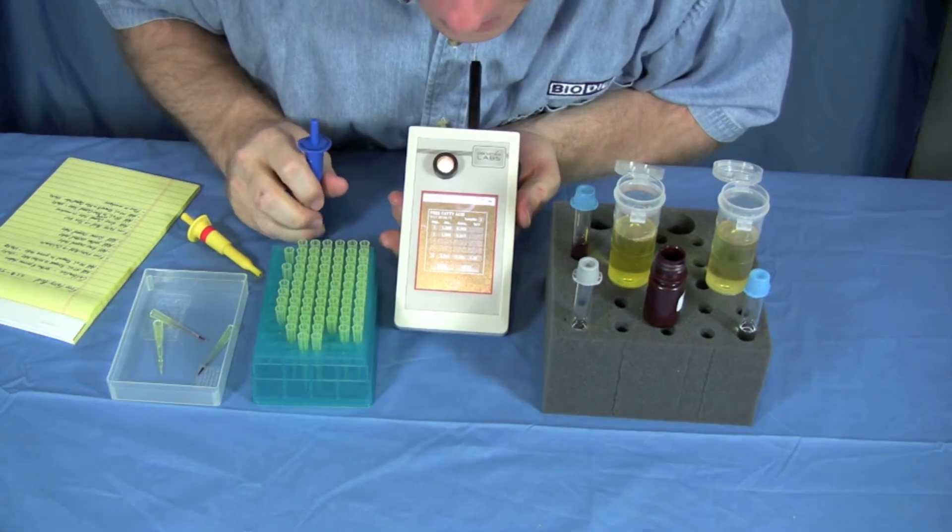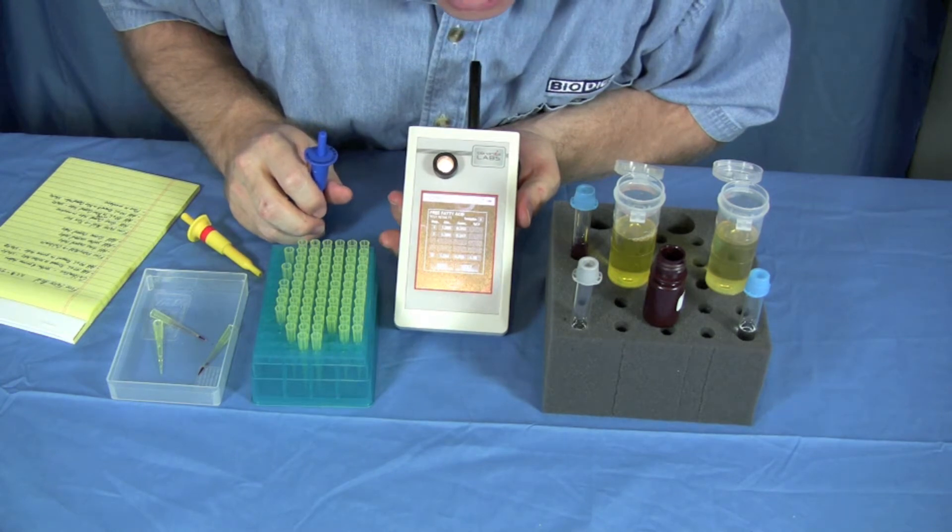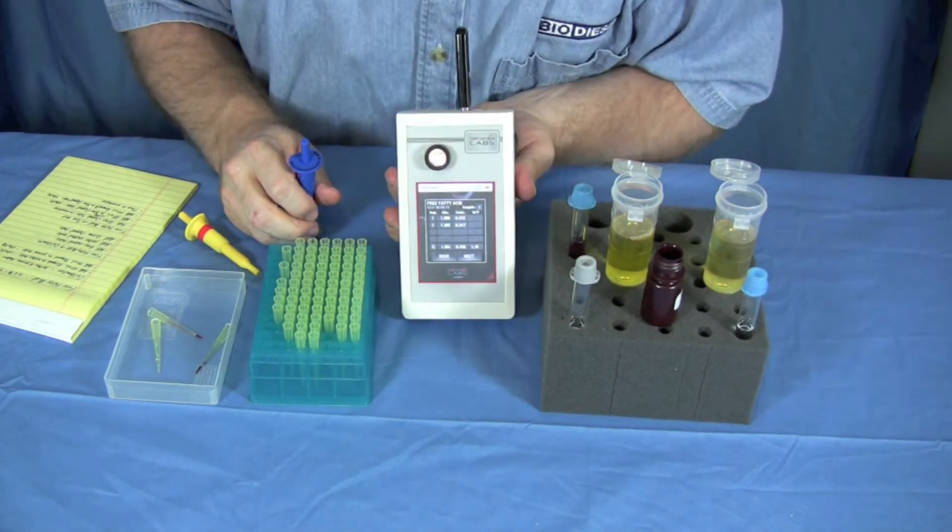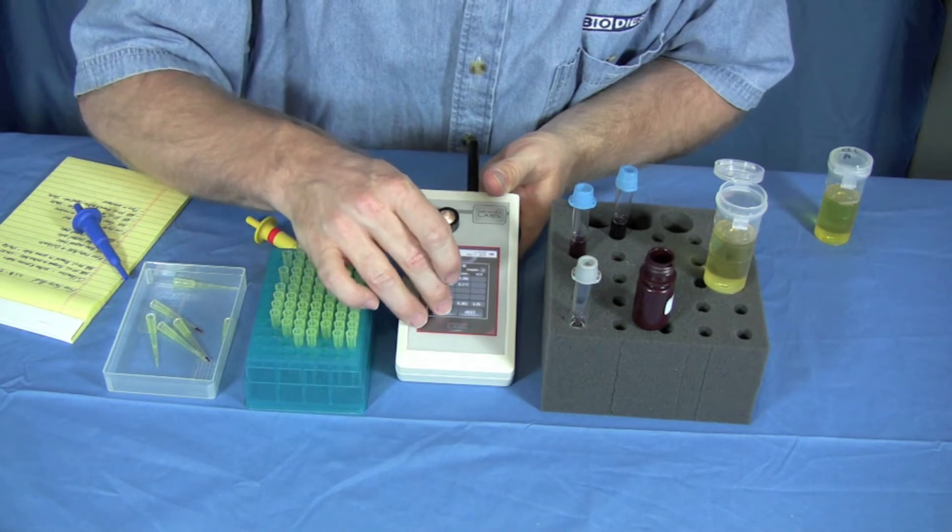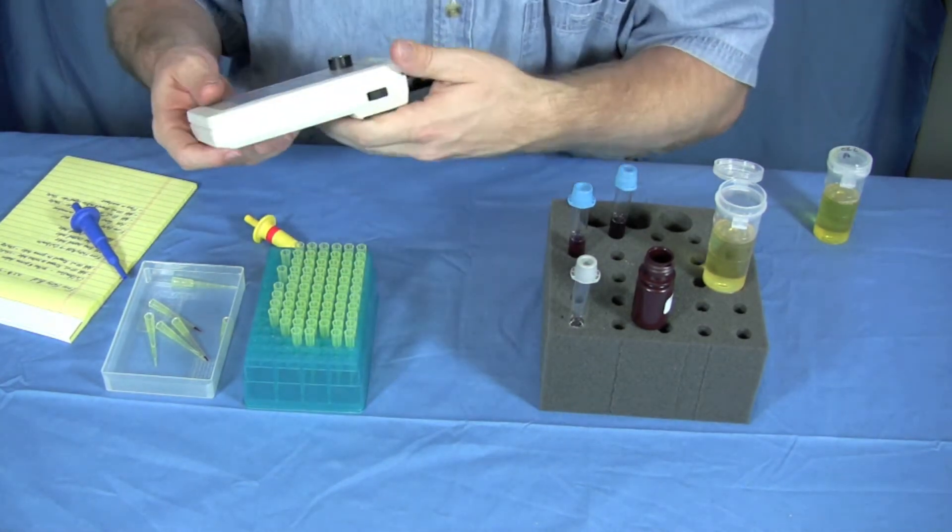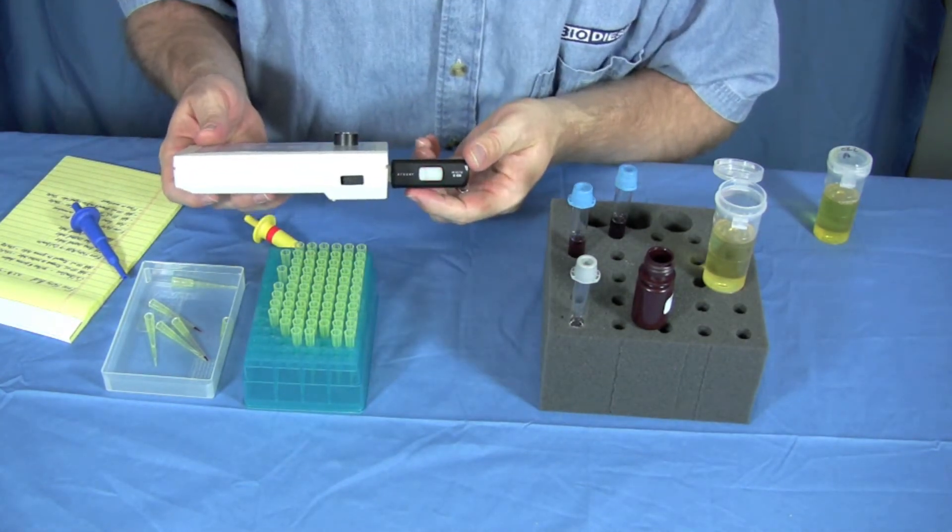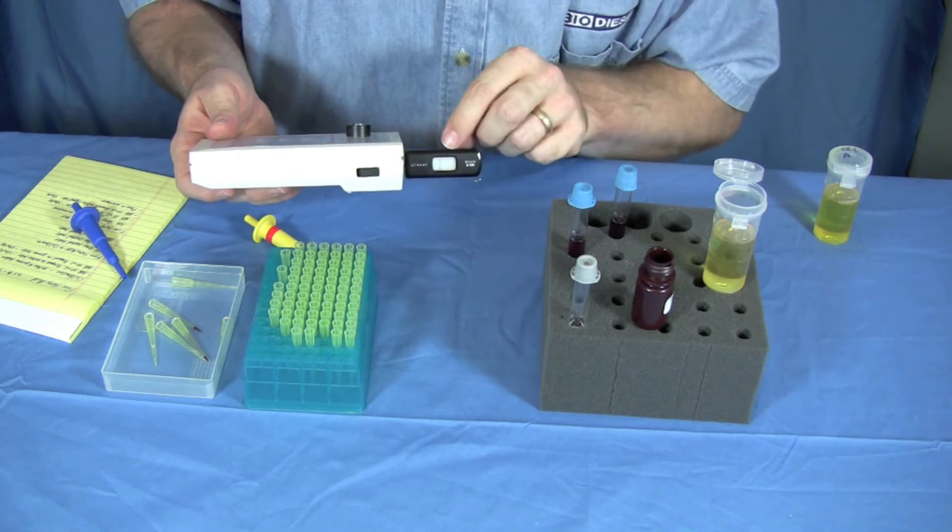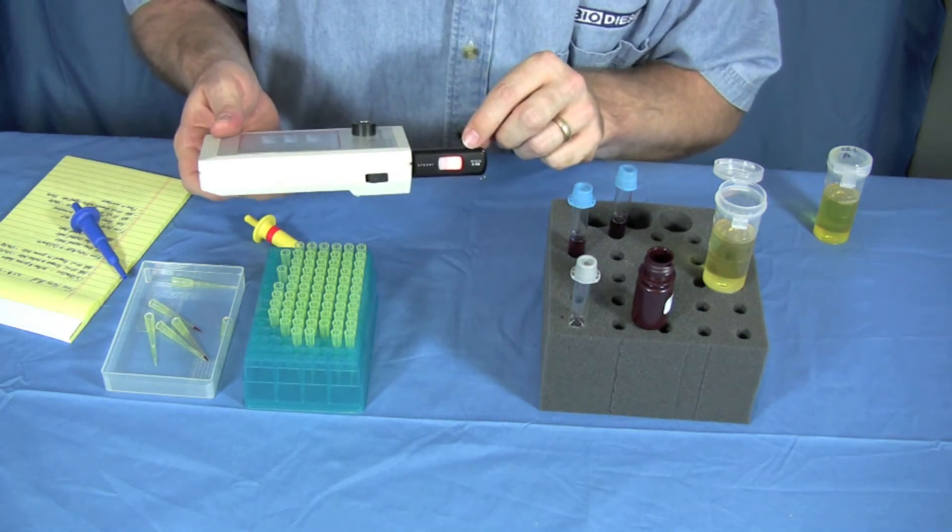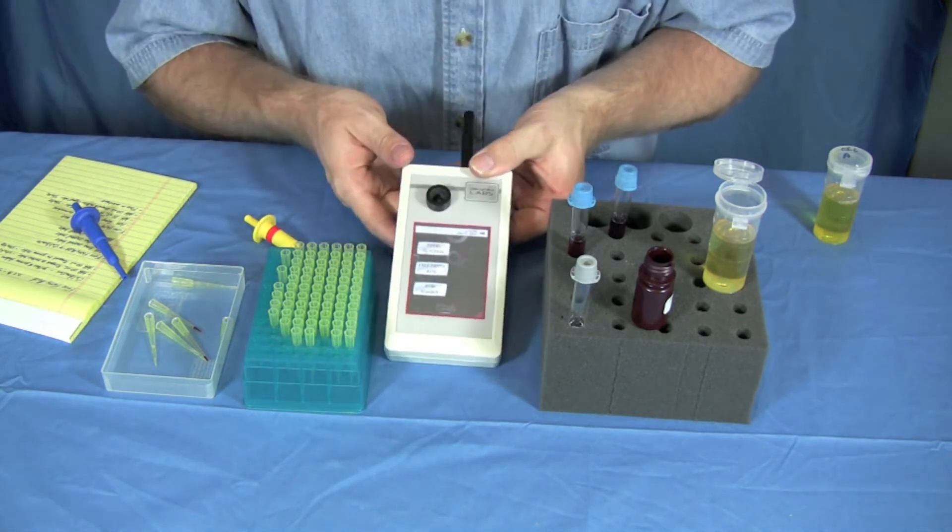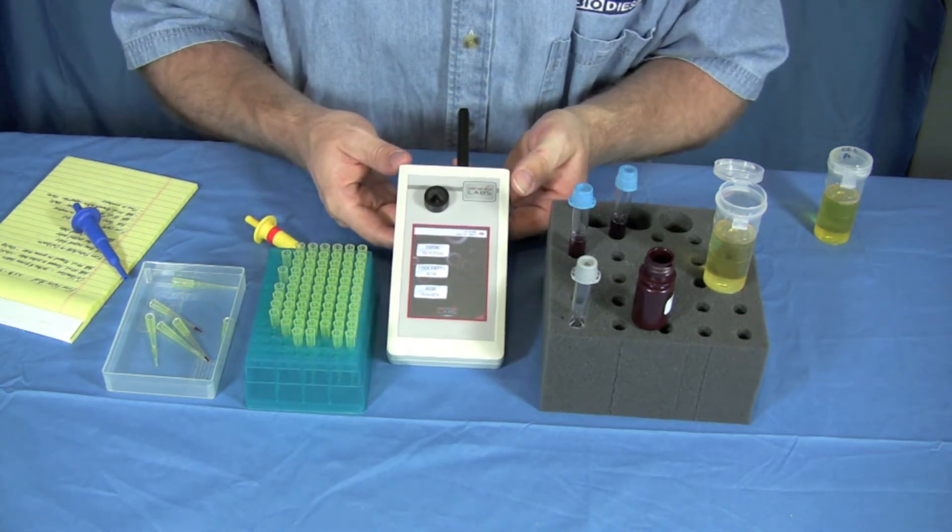So this is 0.35 percent. That's incredibly good oil. We're going to choose done at this point and the machine itself is now going to feed this data right onto this card that we'll be able to look at later in a computer. And that's really how simple it is to do free fatty acid testing.